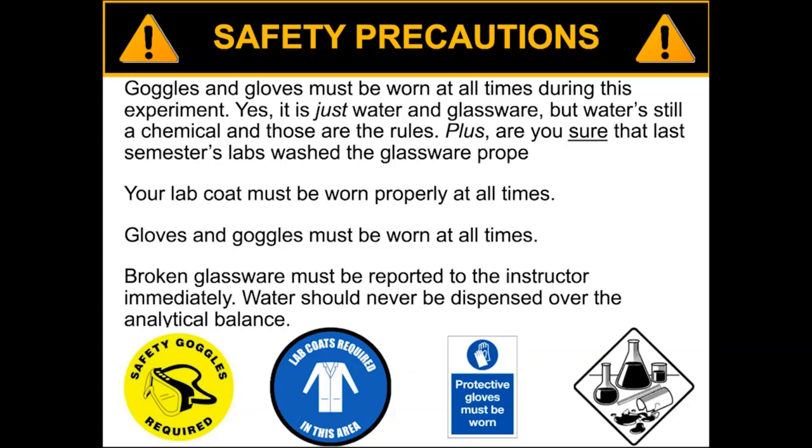If your group finishes before other groups are done, you still need to keep everything on while you're working on your calculations. These are things to expect in a lab environment — you never want to remove your PPE if there's still an experiment going on. And if broken glassware happens, tell the instructor and they'll take proper precautions.